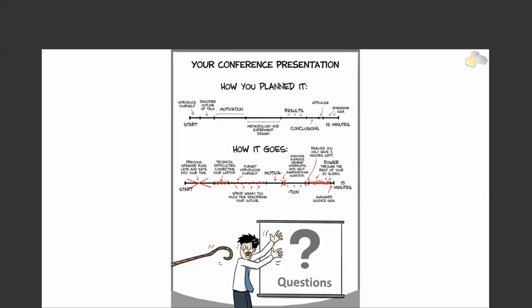DVGs and HIV are slightly more complicated, I think, due to the way that the replication cycle of HIV works, and it might require slightly different references. But that's something that we could possibly do. And essentially, just based on what I've observed in the past, with the longer deletions, I think it would definitely be reporting some deletion type DVGs, but I haven't run this tool yet on this data set.